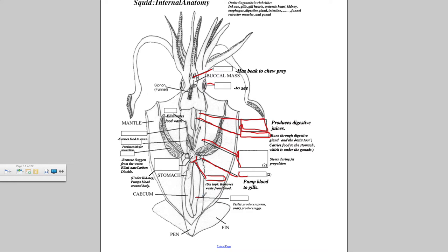This is the male one that we're looking at. So this stuff here, even if it was a female one, it would still be here. So it's kind of a dual organ so we can see both. But this would be your gonad. Pay attention. If you stop talking, you can hear me perfectly fine. Kidney. All right. Pay attention.